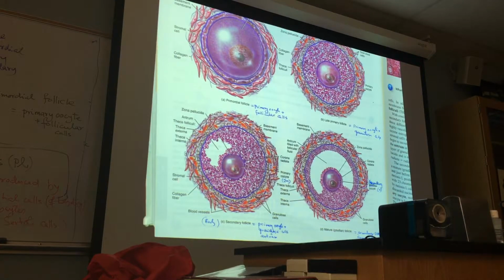This is still primary oocyte, and if you look at the chromosome number, it's diploid. If it was derived from human, it would have 46 chromosomes. Because this is also undergoing a division called meiosis. Have you heard of meiosis? Yeah. Reduction cell division.